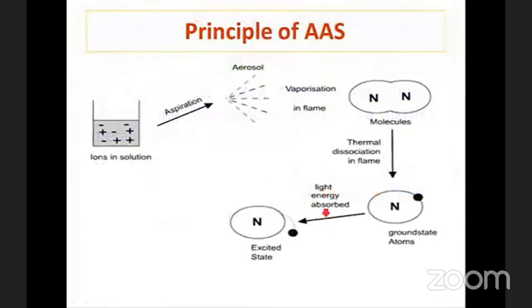Let us see the principle of atomic absorption spectroscopy. The principle is again similar to that of flame emission spectroscopy to a certain extent.